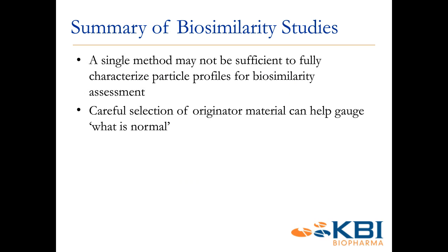Just a quick summary here. A single method may not be sufficient to fully characterize particle profiles if you do start to see offsets when you're looking at biosimilars or if you're doing comparability studies. Careful selection of what methods you do employ, but also if you're doing this for biosimilars, a careful selection of your originator material can really help you too.